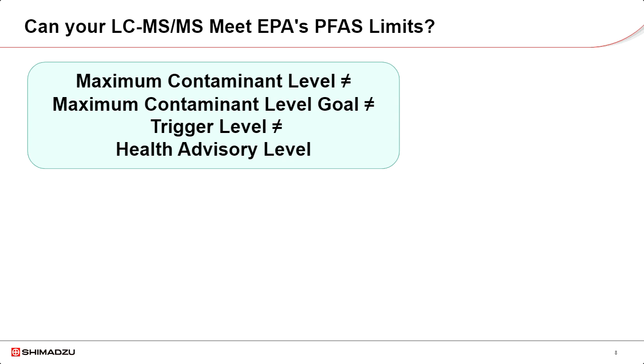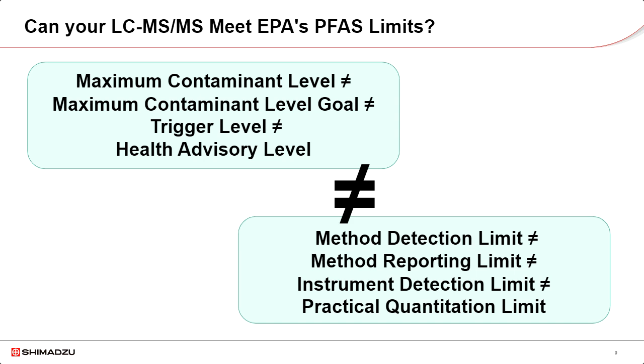As we reviewed a few slides earlier, EPA has set different levels related to PFAS. And those levels cannot directly be linked to the performance of the LC-MS or the performance of the overall analytical method you need to use, 537.1, 533.